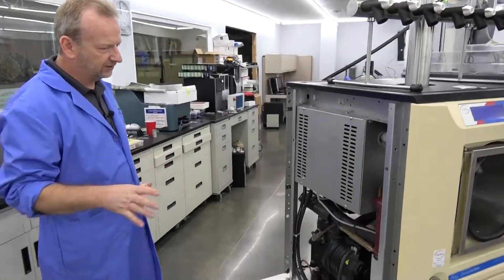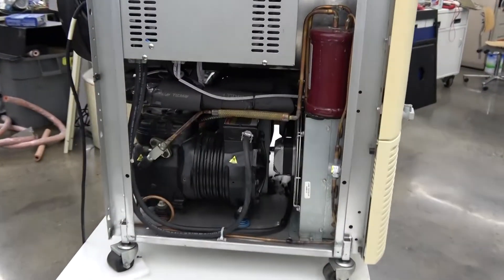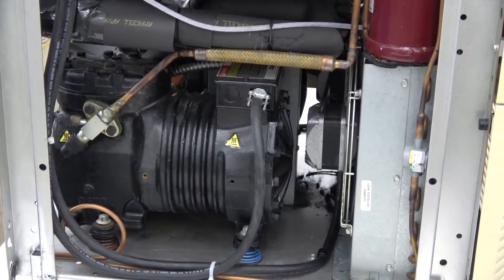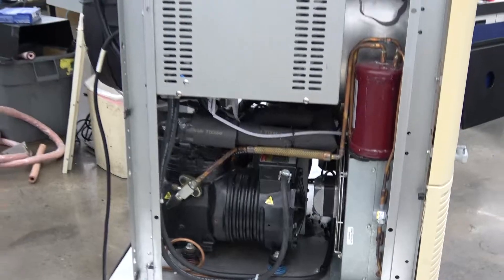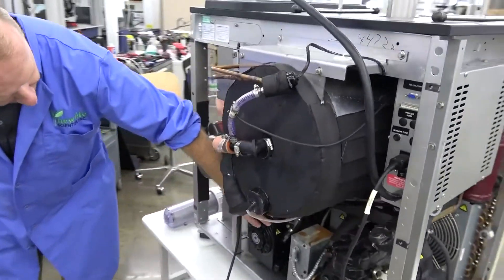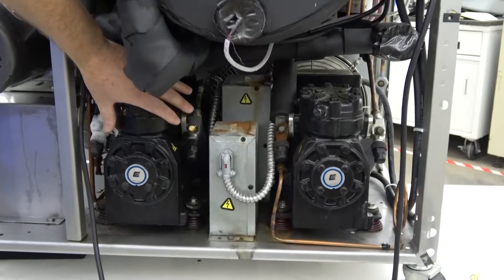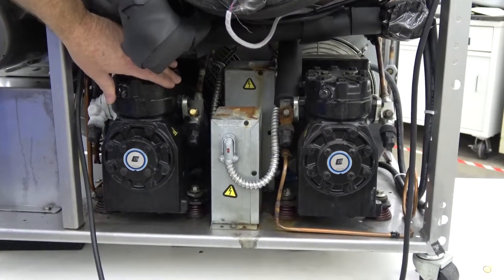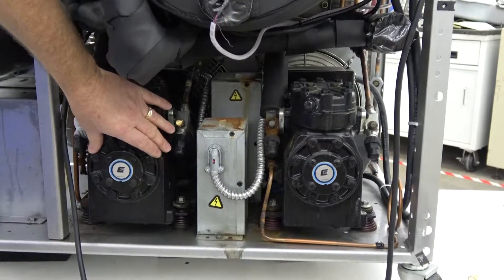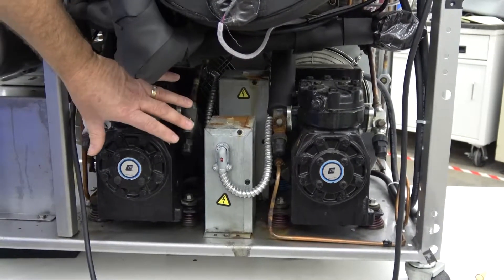We've got the back panels off, so you're going to get a look inside here. You can see this is the low stage compressor. This is a two-stage compression system where you have your high and your low, because it needs extreme cold temperatures. You can see this is your high stage and then your low stage compressor. Both of them are running really well. We just checked the pressures and made sure everything is functioning well. The oil levels look good — everything looked really good on the refrigeration, so we didn't have to do anything. It was working perfectly.